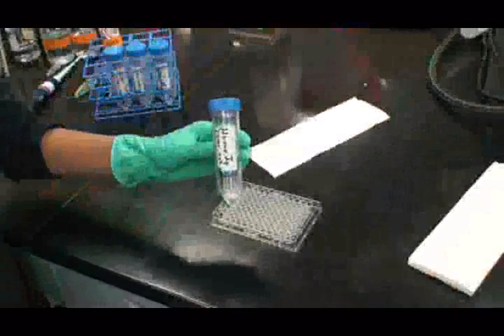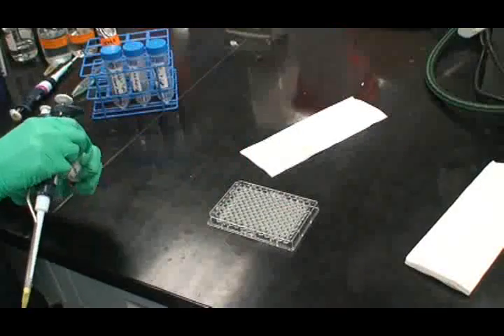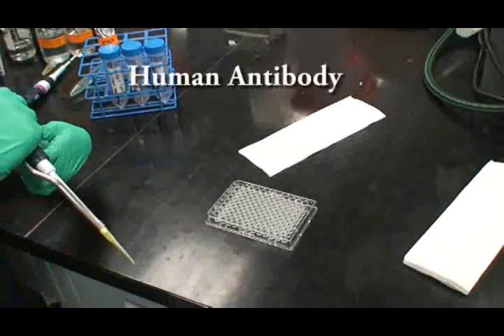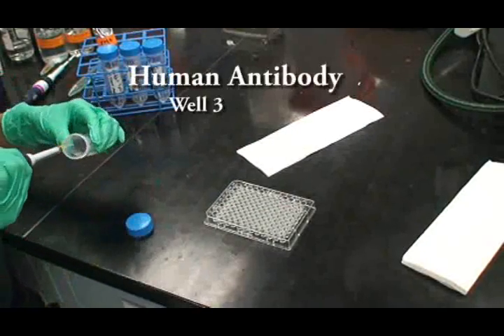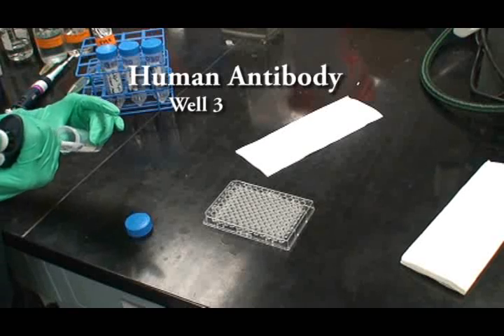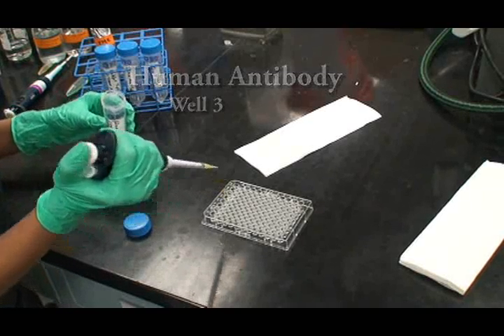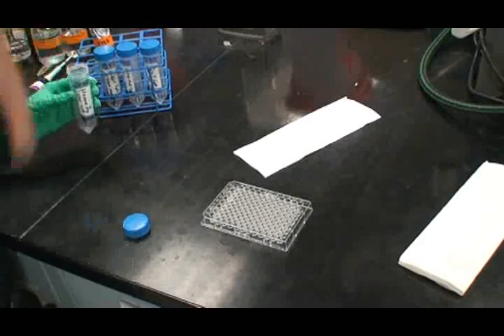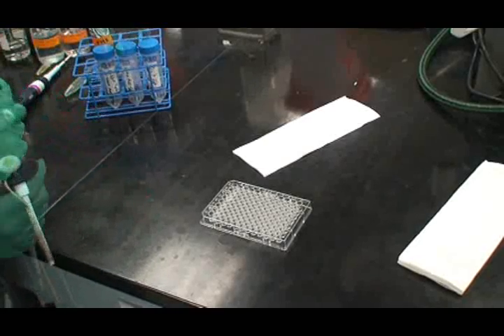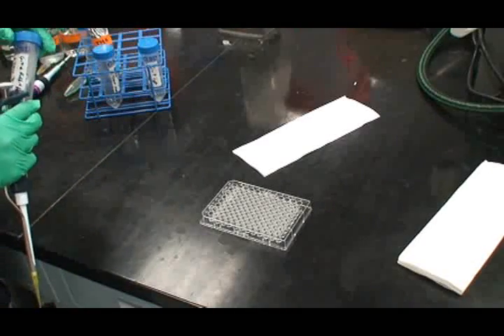Add 100 microliters of the diluted human antibodies to well 3 of each plate. Add 100 microliters of the diluted goat antibodies to well 5 of each plate.